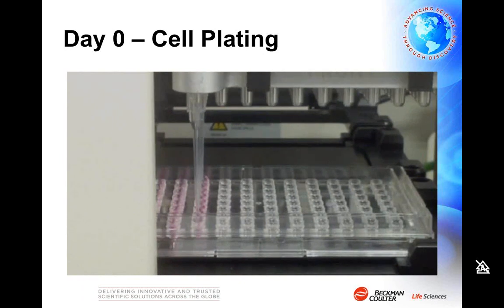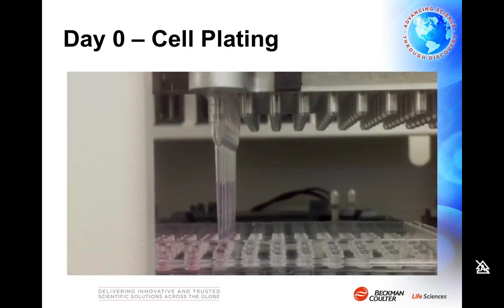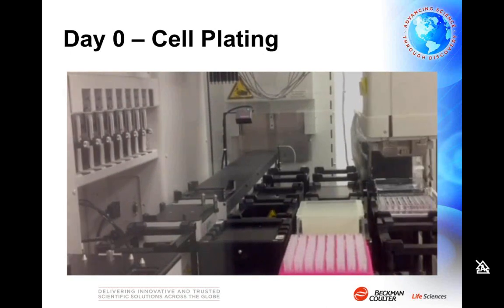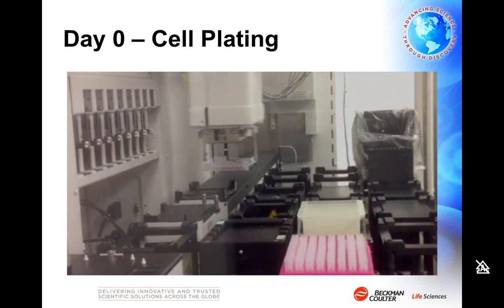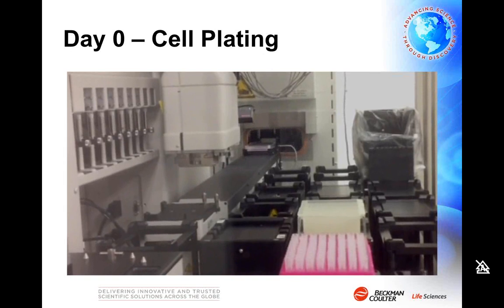You'll notice this extra push down. That basically helps the droplets hang underneath the plate, as Nikki described earlier. And that'll be illustrated again here in slightly more detail. So again, dispense the liquid at the level of the rings and then basically gently push them through. And that was sufficient to give us nice consistent plating. The plate is then relidded. And one of the nice things here is we were actually able to control the speed at which plates are moved in a plate-specific manner. So the system knows anytime it picks up the Perfecta plate, it should move very slowly so as to not disrupt the hanging drops. The plate is then sent on the shuttle to the incubator, passing through a barcode reader, and then incubated for 3 days.